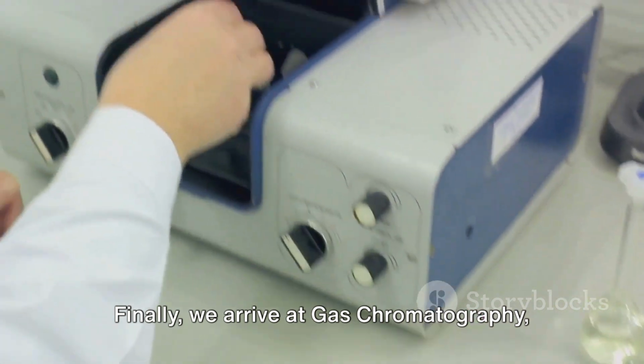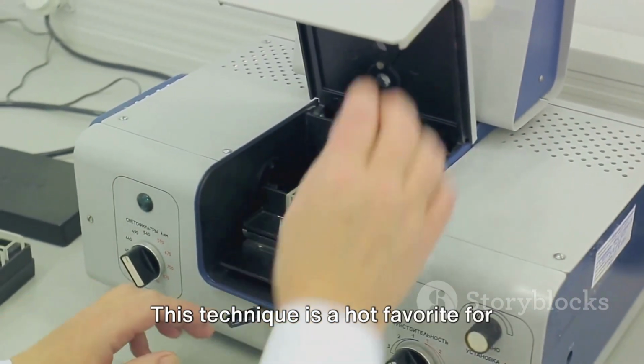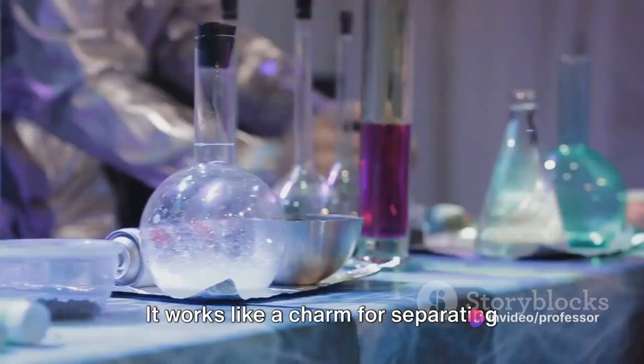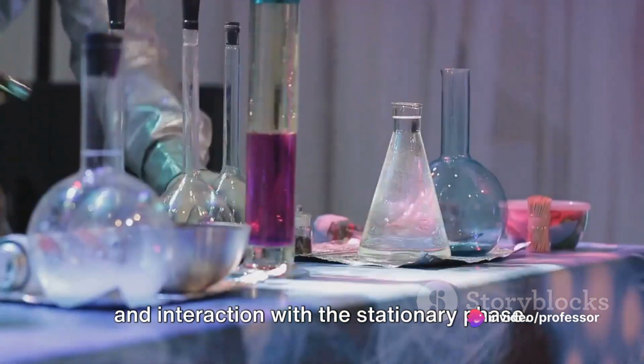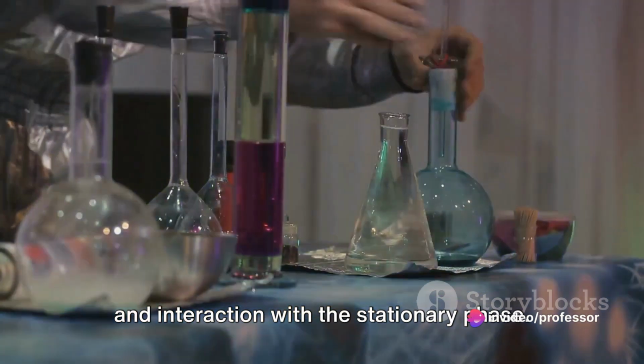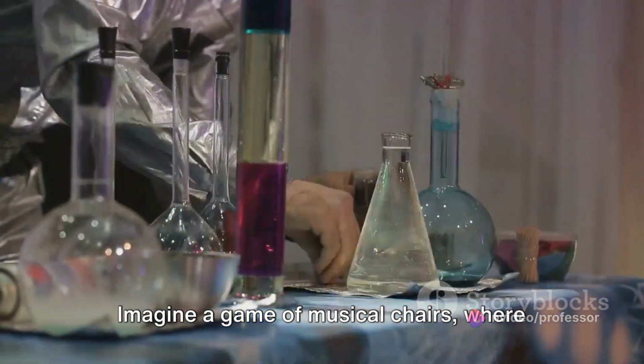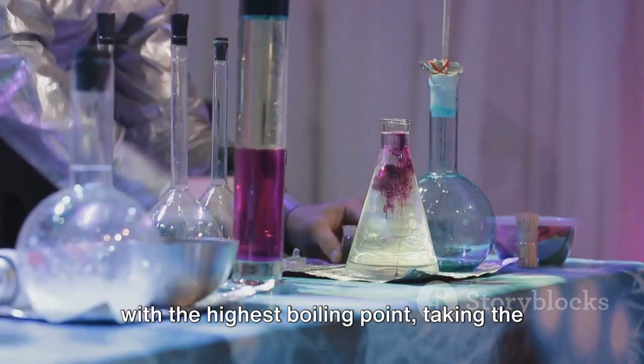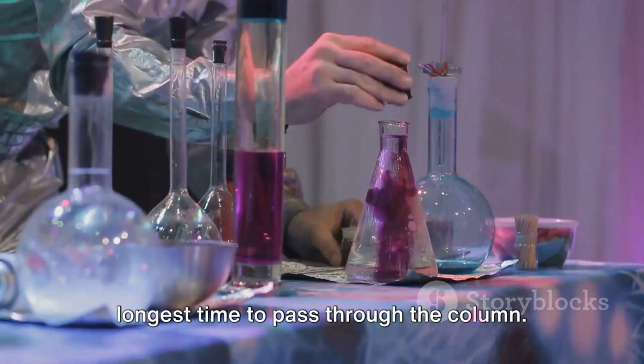Finally, we arrive at gas chromatography, or GC. This technique is a hot favorite for volatile substances. It works like a charm for separating components based on their boiling points and interaction with the stationary phase. Imagine a game of musical chairs where the one left standing is the component with the highest boiling point, taking the longest time to pass through the column.